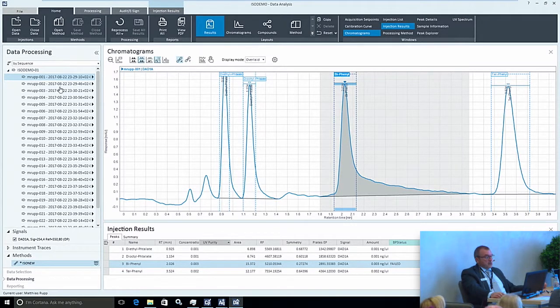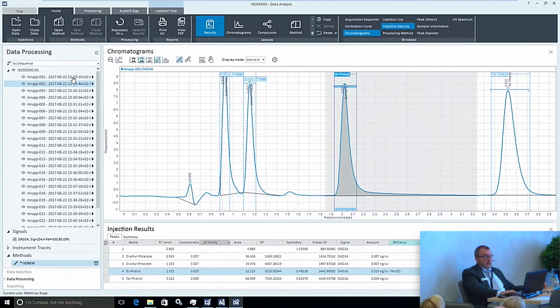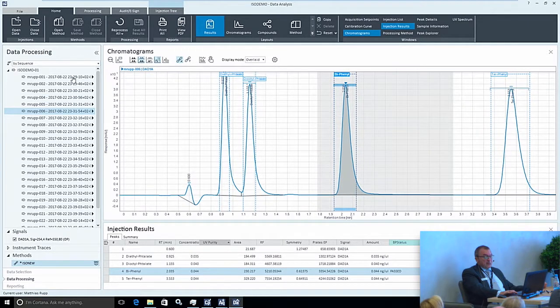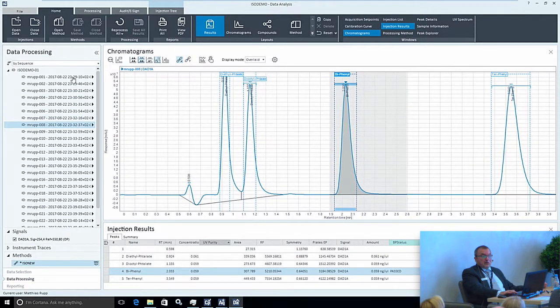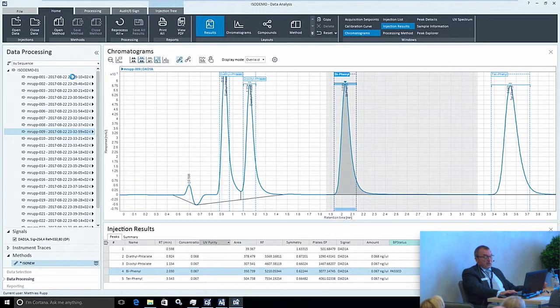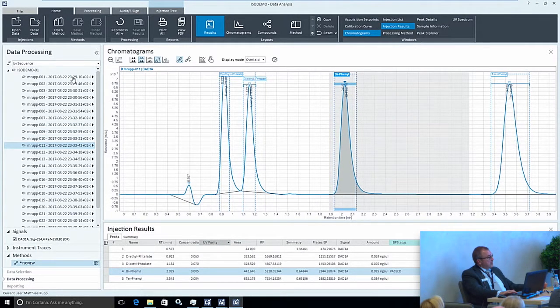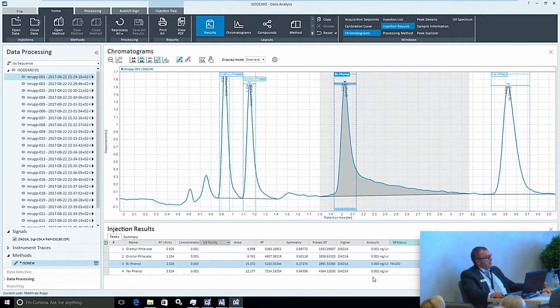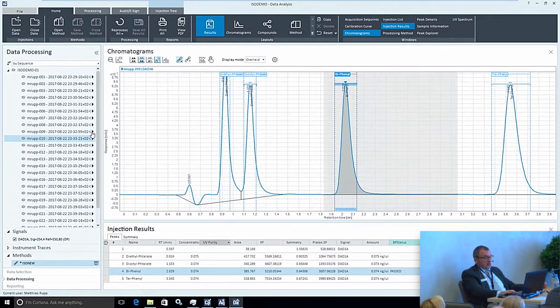And now let's please just do a walkthrough to look at the results of this sample and do it for all the others. I just browse through the single samples and you instantly see the final amounts, the calculated amounts, and the status. Now these samples turned into a passed status, right? If I go back to my very first sample, it's below the limits, it's showing failed. So it instantly shows those results.